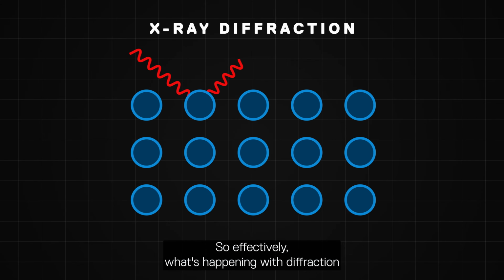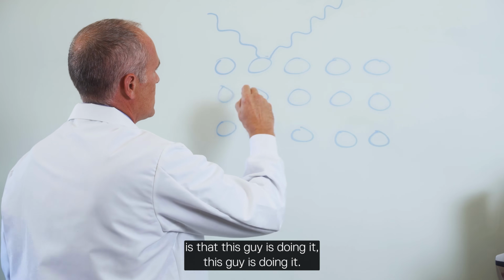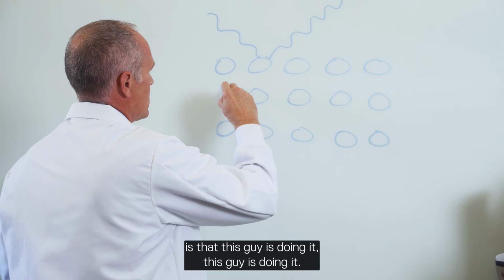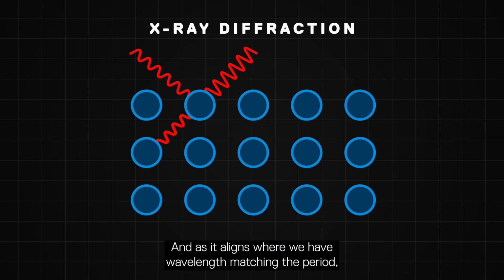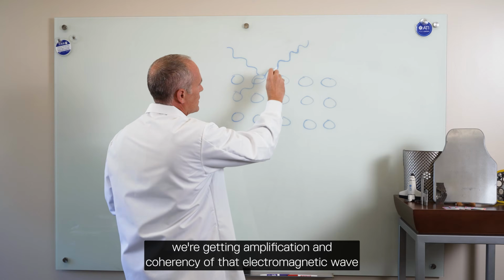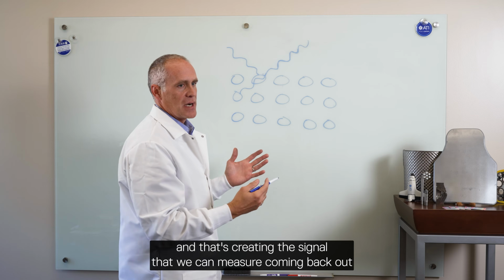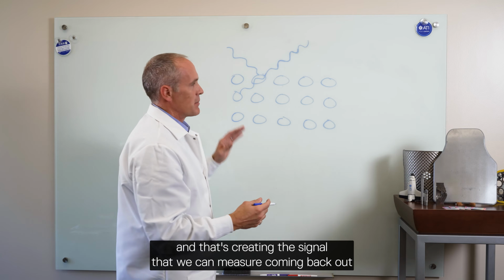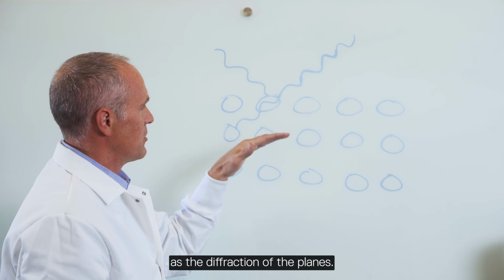So effectively what's happening with diffraction is that this guy is doing it, this guy is doing it, and as it aligns, where we have wavelength matching the period, we're getting amplification and coherency of that electromagnetic wave, and that's creating the signal that we can measure coming back out as the diffraction of the planes.